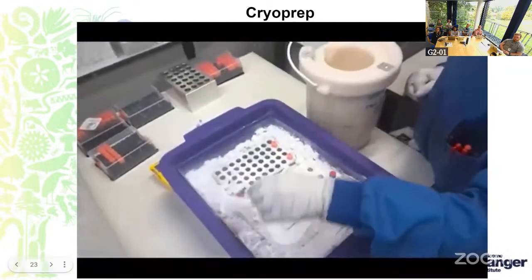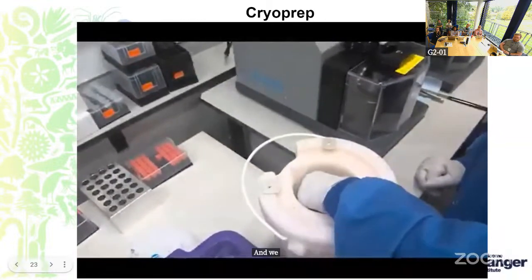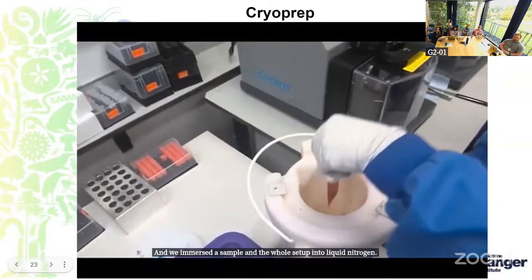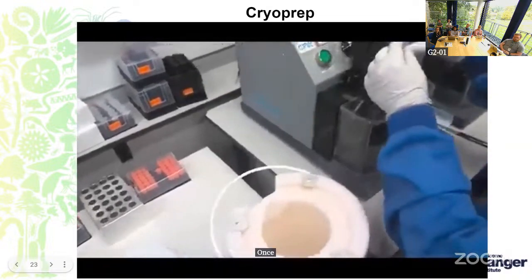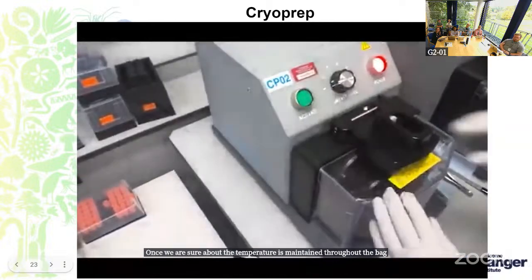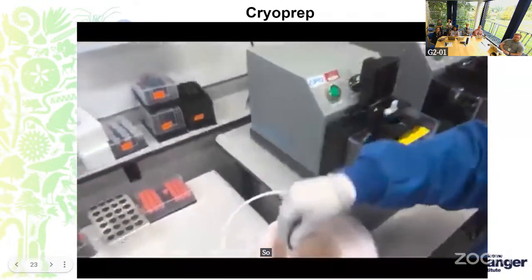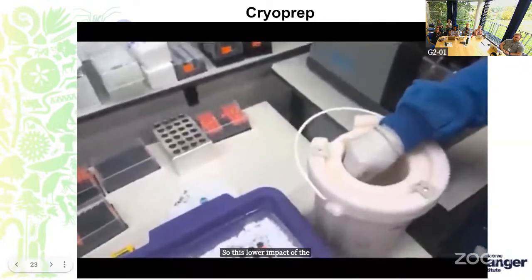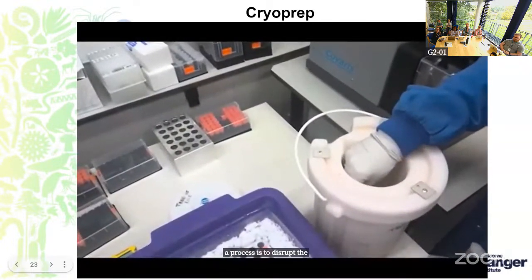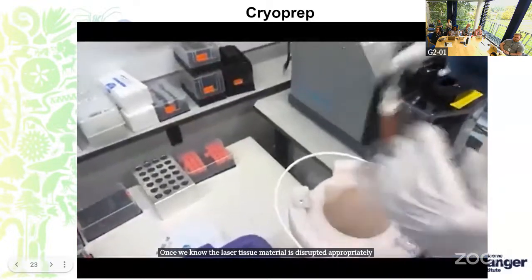Now we take it to the cryoprepping area and we immerse the sample and the whole setup into liquid nitrogen. Once we are sure the temperature is maintained throughout the bag and the tube, we leave it on the machine and start off with a lower impact. This lower impact is to disrupt the larger tissue material.